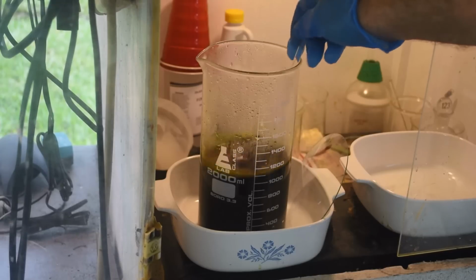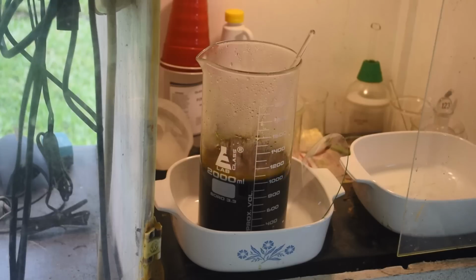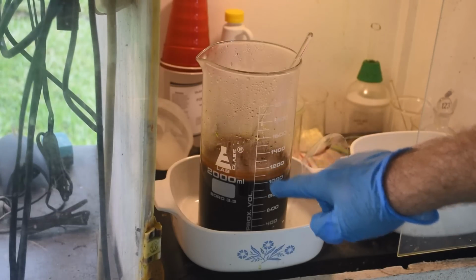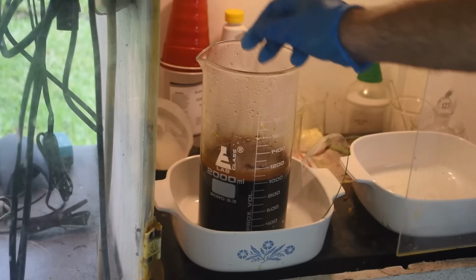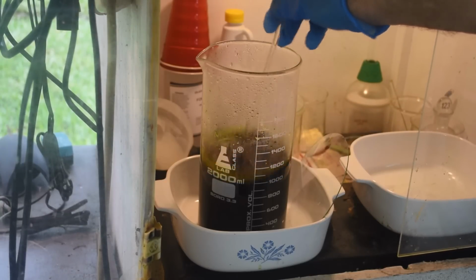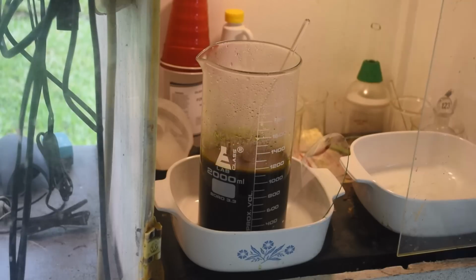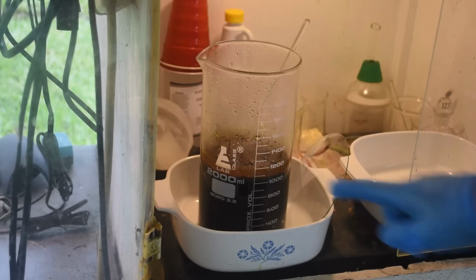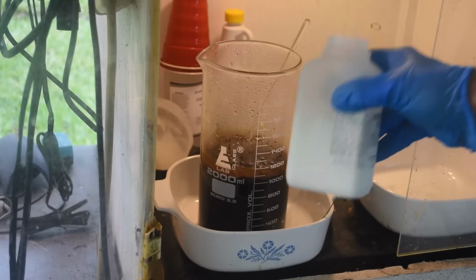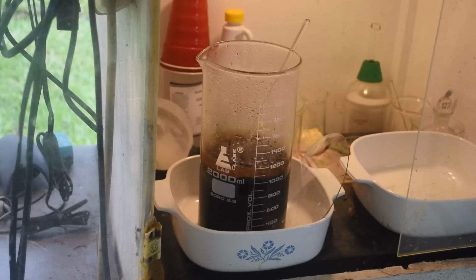But what we're looking for here is the formation of a red precipitate. And yes, we are getting some red stuff. Look at that. Yeah, we're getting some red stuff. That red stuff is palladium ammonium chloride. And yeah, we're getting some serious foaming going on. Just a little bit of this stuff makes a lot of chlorine gas in there.